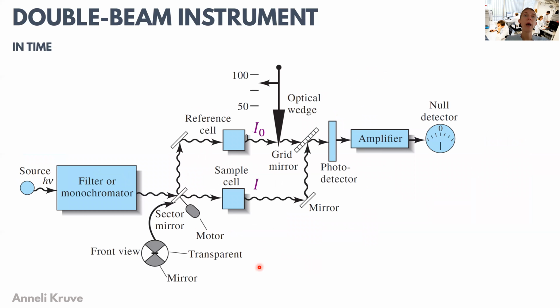We can also have a double beam instrument that is splitting the wavelength in time and not in space.